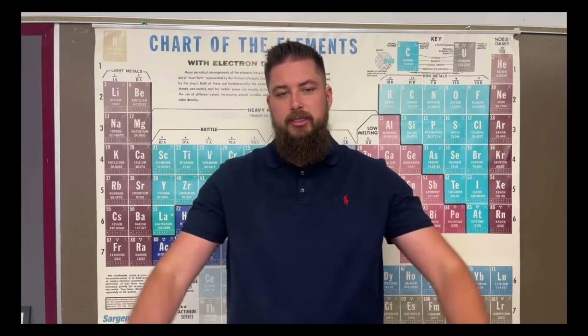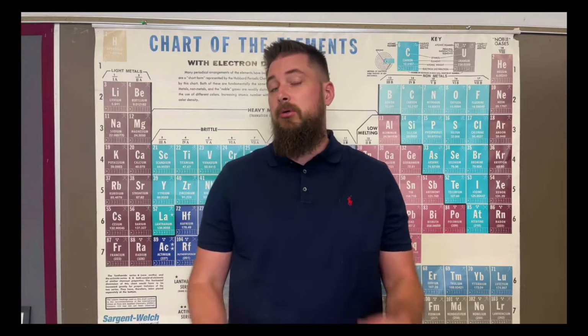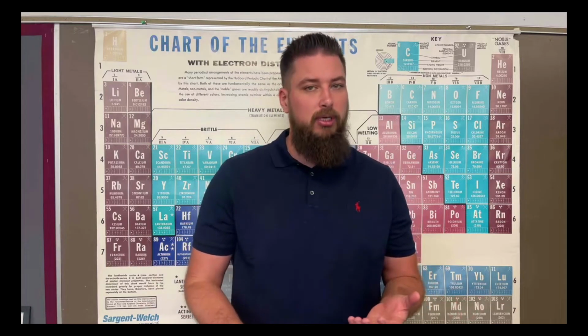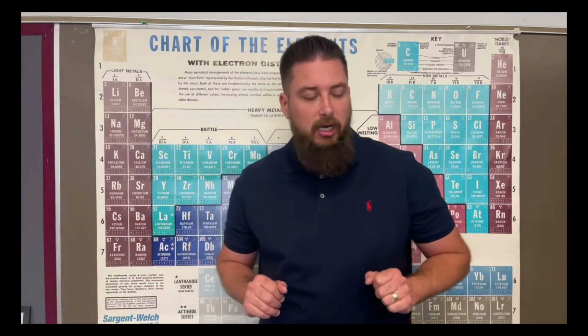All right, let's go ahead and get started here. What we're going to do is talk about titrations today. Before we take the notes, I am going to go over what a titration is and give you an example of one. And just a disclaimer, it is a very rough example of a titration.